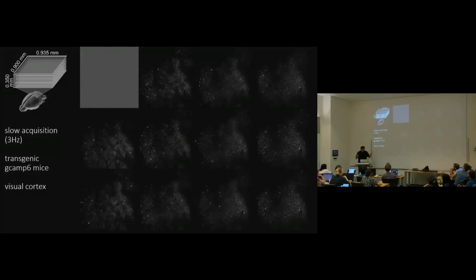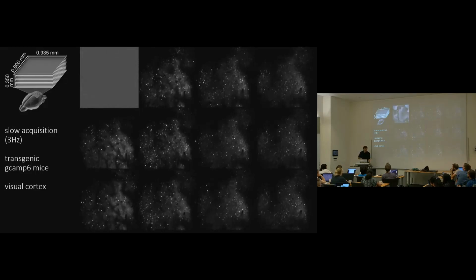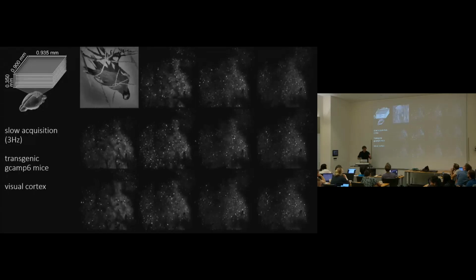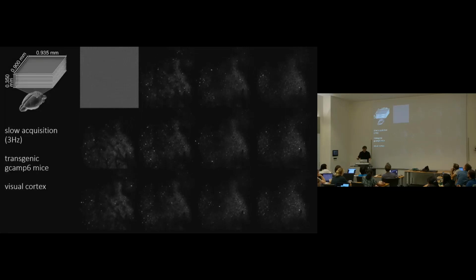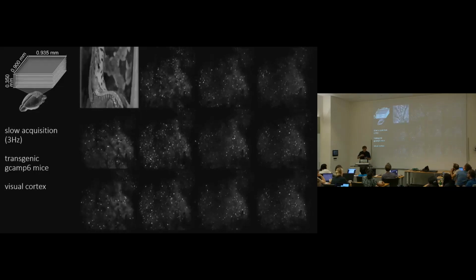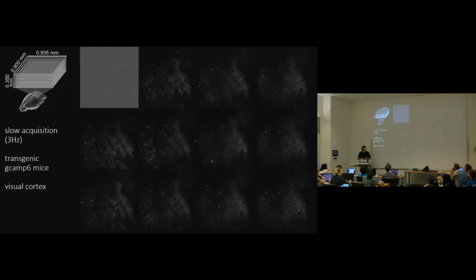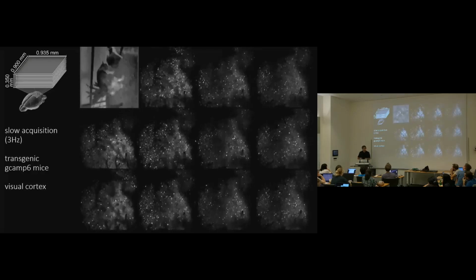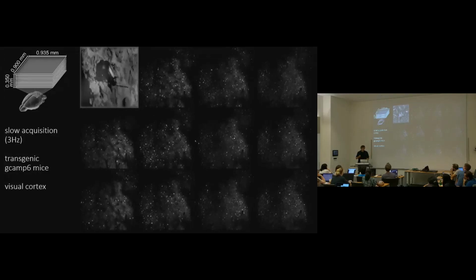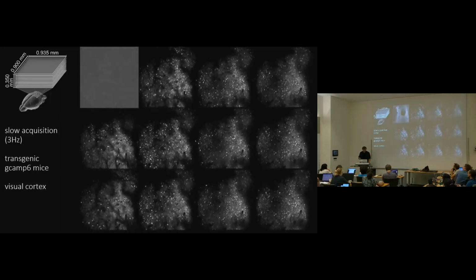I mean, a single person can record like 3 big data sets like this in a day, and if we have to wait another 2 weeks before they get processed, that would slow things down. So currently, suite2p can process a data set up to this size in about as long as it took to record it. So it allows us to do this kind of, let's say, closed loop science, right? Where we do a recording like this one day, we let it process for a few hours in suite2p, and then maybe in the afternoon or evening we start analyzing those results, get a sense of what happened during the recording, maybe use some of the visualizations we built into suite2p that we're going to tell you about later, and then get a sense of how I should change my stimuli or my behavior to get a better experiment.